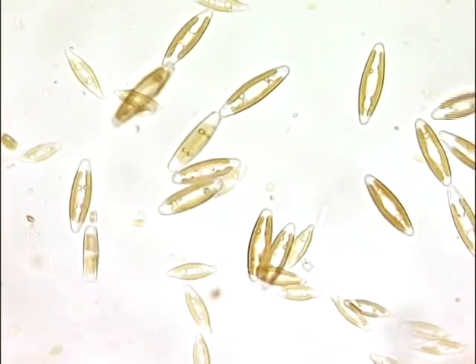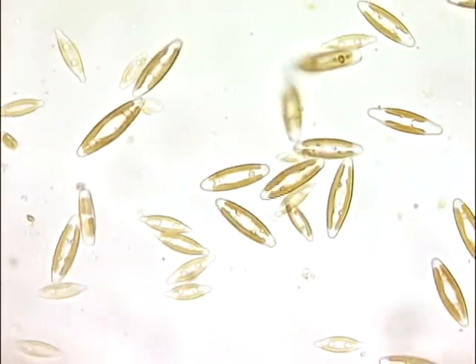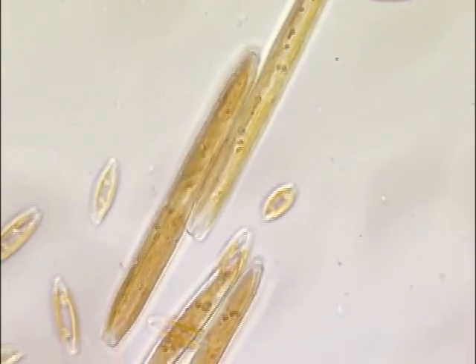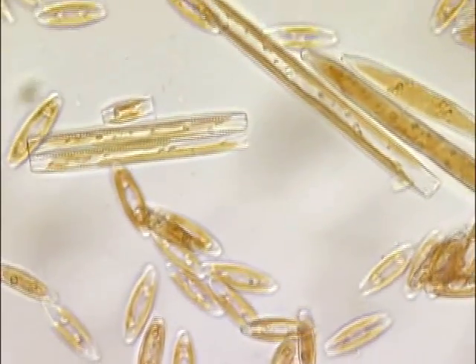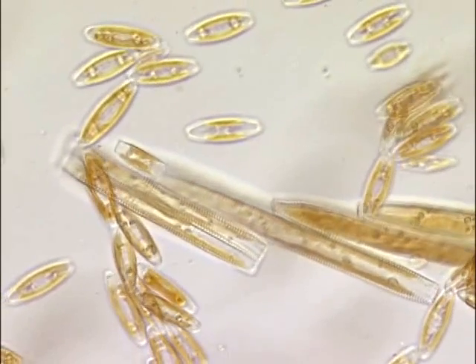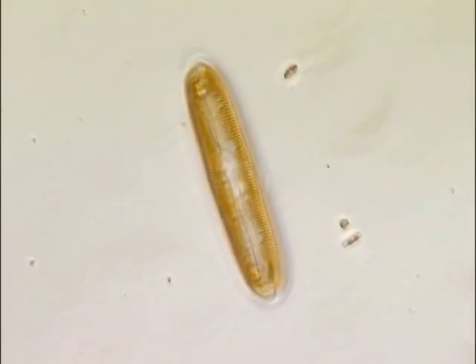These are living diatoms. Some species of diatoms are capable of movement, and others are not. The way diatoms move is unique compared to other microorganisms. Diatoms secrete small mucus fibers through their shells. The mucus enables them to easily slide about on the surface of rocks and sand.